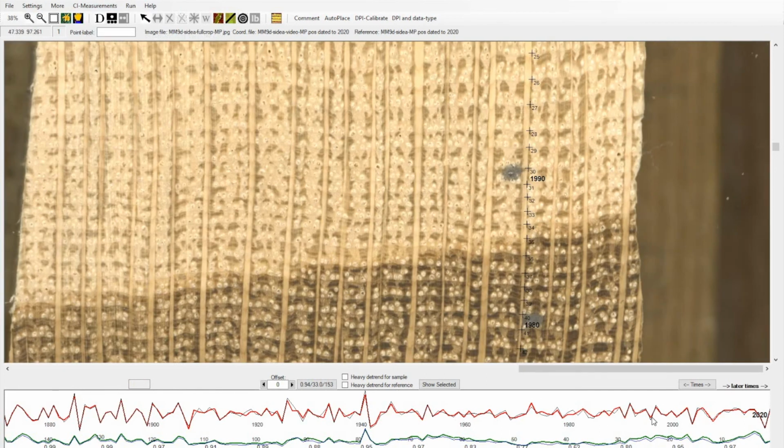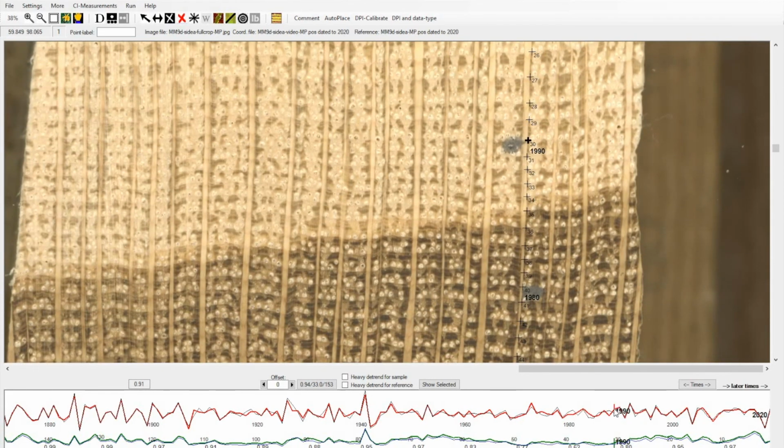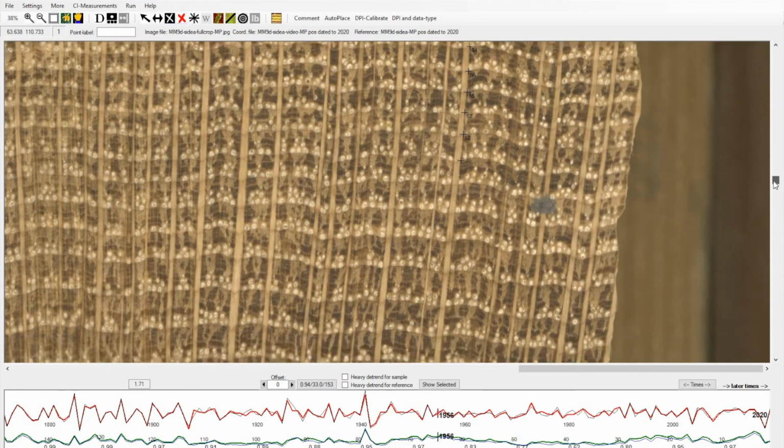You can see that we have a 94% correlation, with that .94 measurement for the correlation, and you can see specific years and specific measurements where there might be more differences, and we can see where there might be mistakes or inaccuracies, and compare that and see how we can improve it before adding it to the overall chronology and get more accurate measurements.